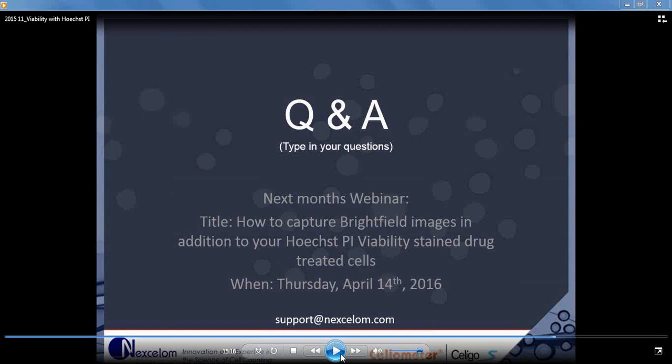Dmitry, your first question is, you had mentioned that while the system is continuing to acquire the images over your whole plate, however many wells you have, once you start receiving those green ones, you can then move over into your analysis to set your analysis settings. Correct. So the question here is, will it slow down your system, your Celigo, the processing, if you are trying to do both at the same time?